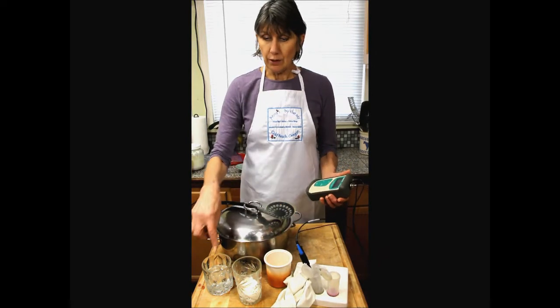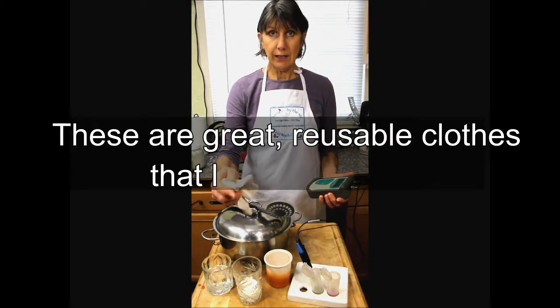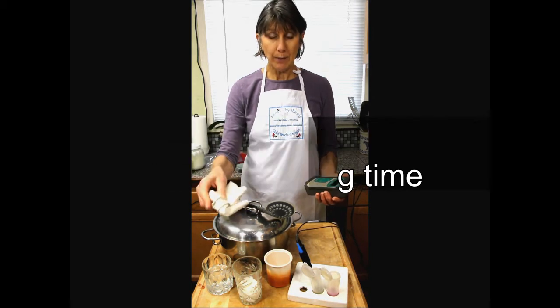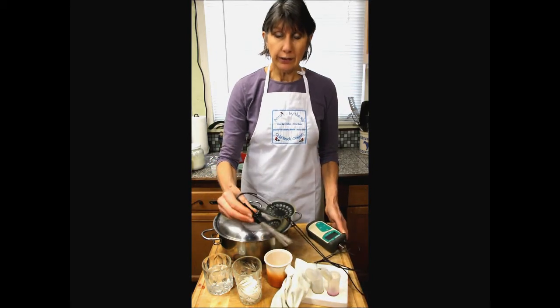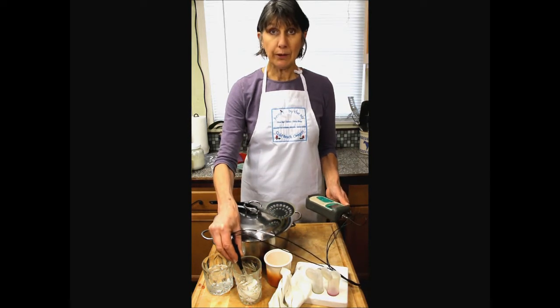So I've got some water here to rinse the electrode in, and a static-free microfiber cloth that I use to blot it. Kim wipes also work well. So let's get right to it. After calibrating your meter, you want to take a reading and dip it in that water, blot it off. We're going to check this cold milk.